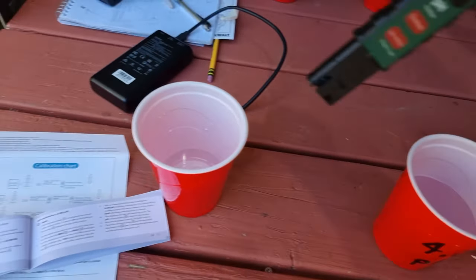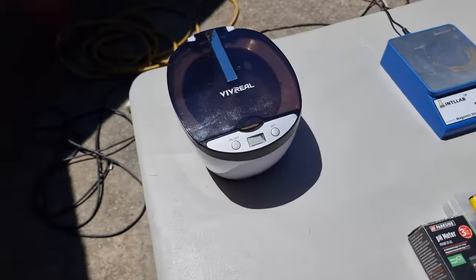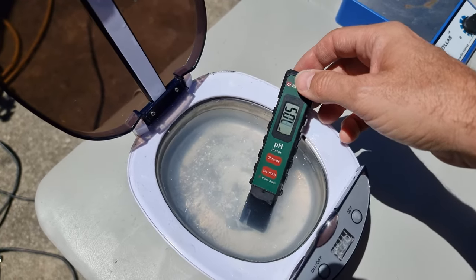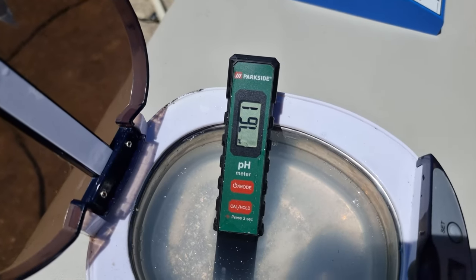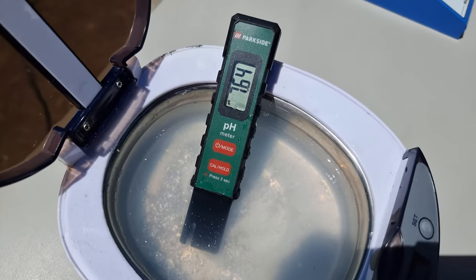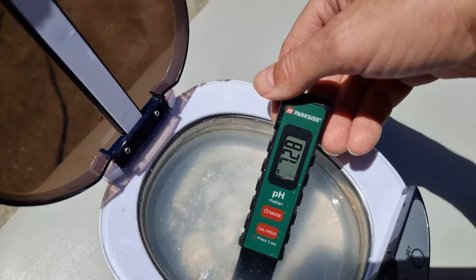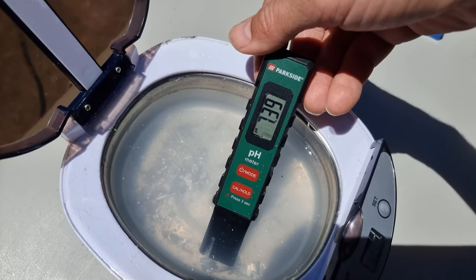So we're going to rinse that off in our distilled water here and put it into our tank from yesterday to see what the pH is after our experiment — that's the question. Oh no! And he drain-sinks it. It is reading 7.62. Bearing in mind that was distilled water to start with, that is mildly alkaline, as was expected. Just to check again, moving it around: 7.3, 7.4.